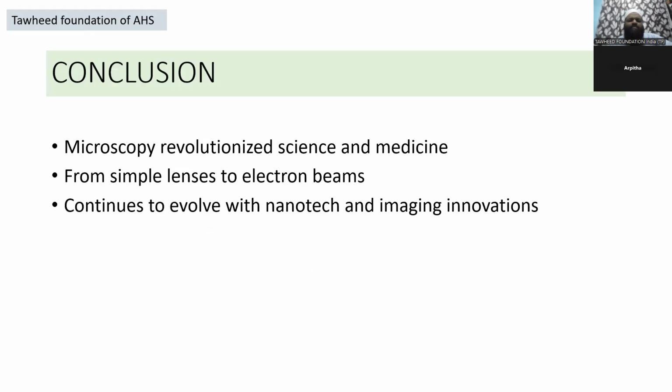Microscopy revolutionized science and medicine from simple lenses to electron beams. It continues to evolve with nanotechnology and imaging innovations.